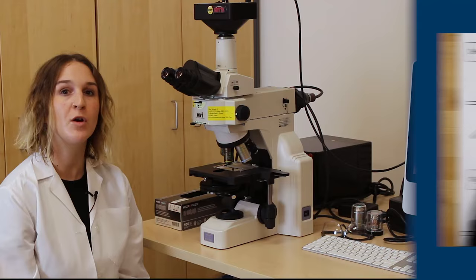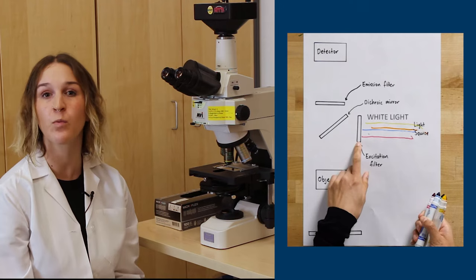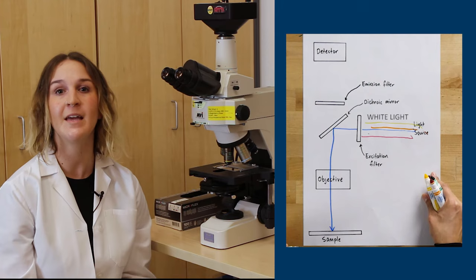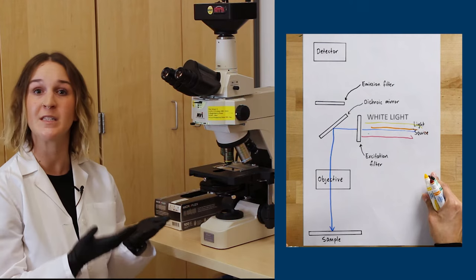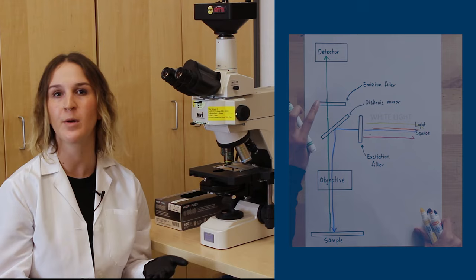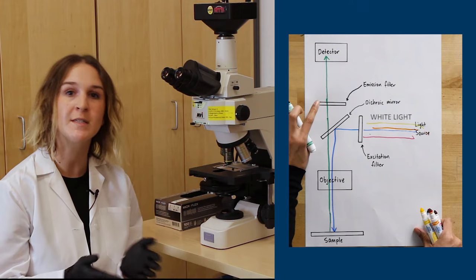But now that we're using fluorescence we're going to change our light path a little bit. So we first want to illuminate our sample not with white light but with a particular color of light because we want to use the wavelength of light that excites our fluorescent molecule. And then we don't want to collect the light that's transmitted through our sample but we want to collect the light that's emitted from our fluorescent molecules that's a slightly higher wavelength, a different color of light.